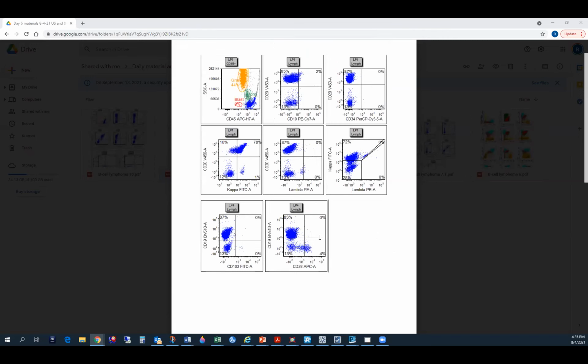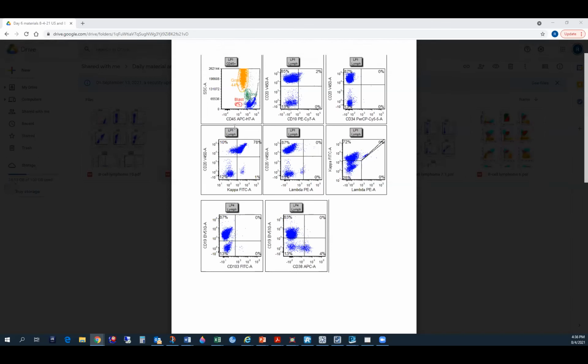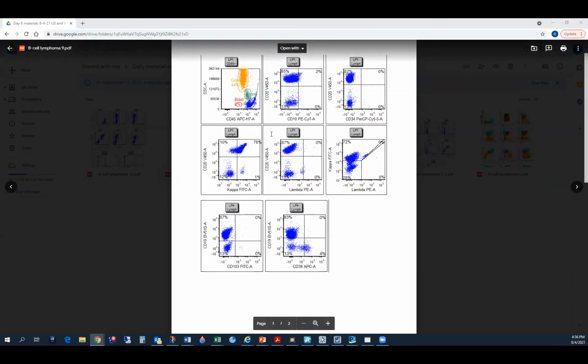So it's nice to remember, because when you see a population of plasma cells, I mean 38 bright cells, you want to compare it with something. NK cells are the ones to compare, because plasma cell 38 is brighter than the NK cell 38. They are here along with your T cells, which is why they are negative for 19, and you get them here along with them.